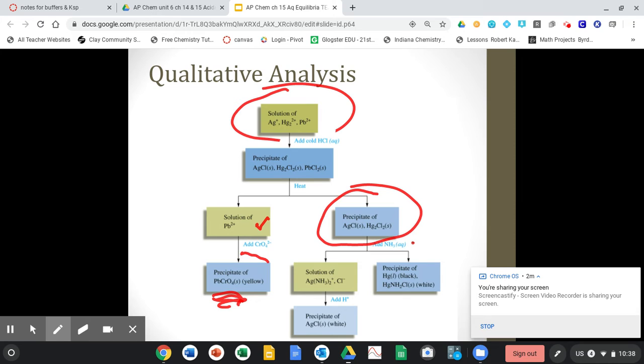That even goes clear back to chapter 5 when we did the oxidation reduction reactions in acids and bases. And now we're doing it with one that forms an equilibrium, because these are mostly slightly soluble substances. And so they're going to have KSP values, and you can affect those KSP values by either adding acid or base. So this one, we're going to start off by making the pH greater than 7 by adding ammonia.